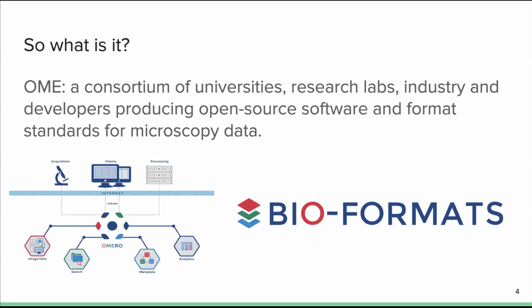Bio-Formats, which you may be more familiar with, is a Java library which can read around 160 different life sciences image formats. That's used in Fiji, so even if you are not aware of having used Bio-Formats, there's a good chance you have anyway. They also run the Image Data Resource, a public bioimage repository, and have previously developed OME-XML and OME-TIFF, which I would say are current generation formats for storing and exchanging microscopy data.